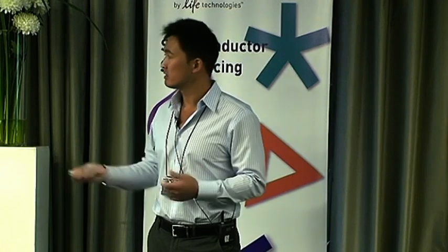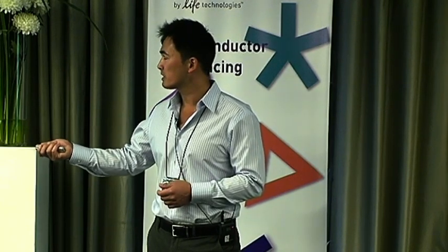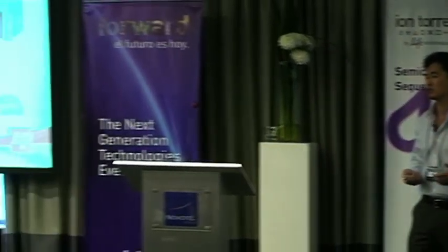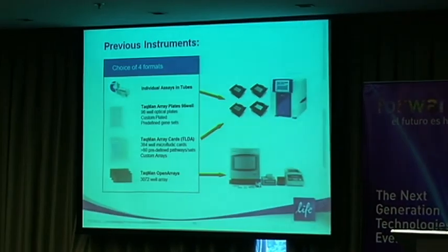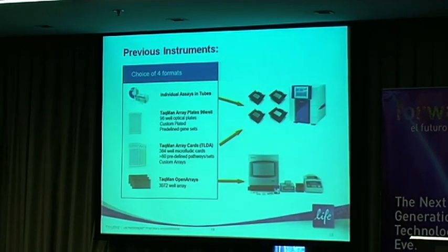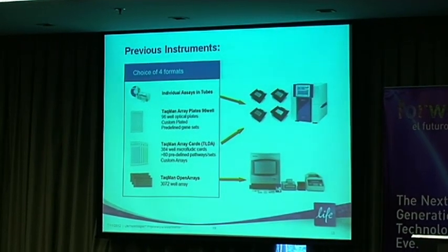So the idea, and of course this system, and I was explaining this to researchers outside, this system can only run open arrays. So this platform, if it's in a lab where you're just doing high throughput research all the time, screening large numbers of samples, well then that's fine. But the majority of researchers basically didn't have projects of that size all the time.